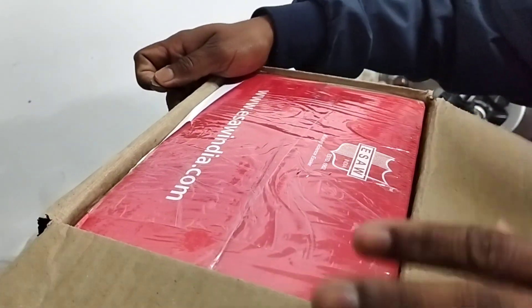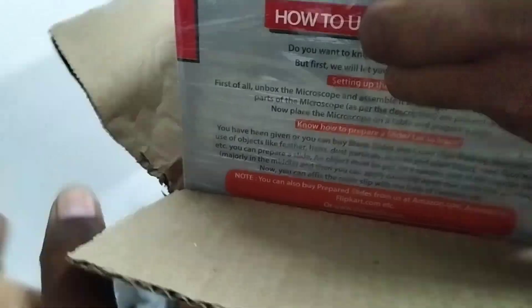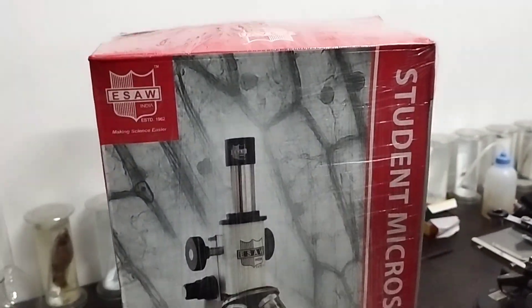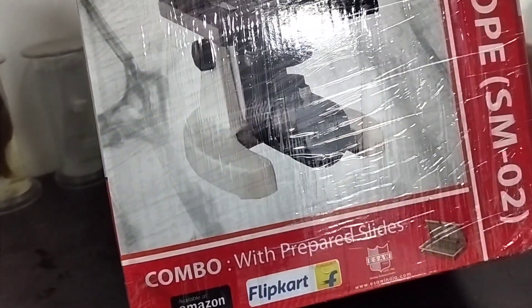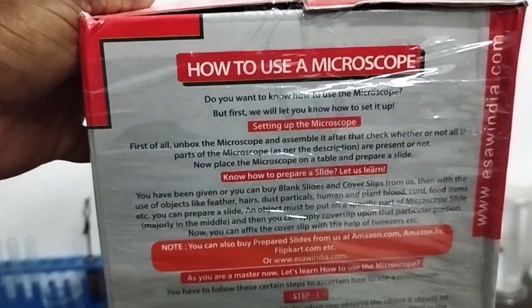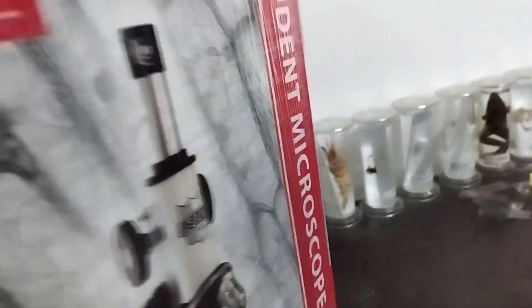There is another box inside. Someone is helping me as cameraman today. Here is the box inside the box — the brand name is shown here with the picture outside. A combo with prepared slides is available on Amazon. The specifications and details about how to use the microscope are printed outside, along with an ISO certificate. Let's open it.